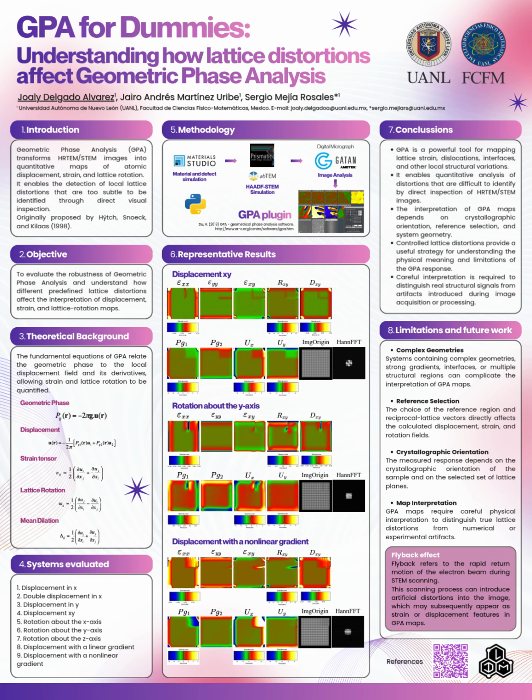Finally, the images were analyzed in Digital Micrograph using a GPA plugin. 2 reciprocal lattice reflections were selected from the Fourier transform, and these reflections were used to calculate the geometric phases, displacement components, strain components, lattice rotation, and dilation.